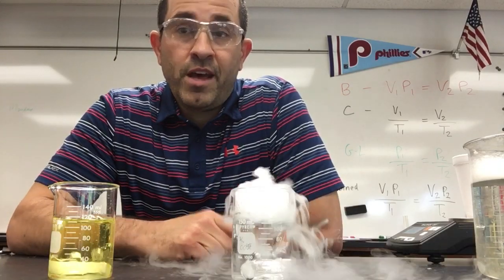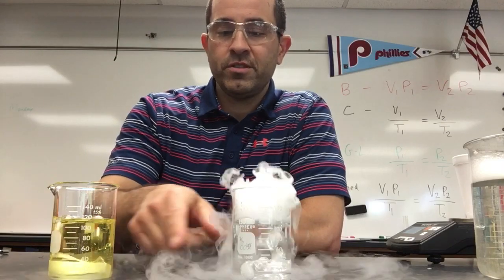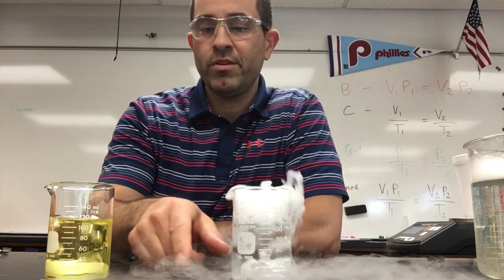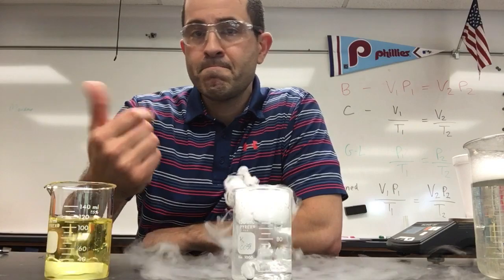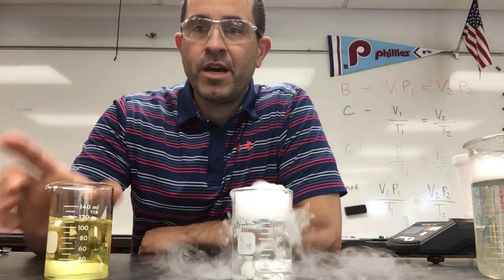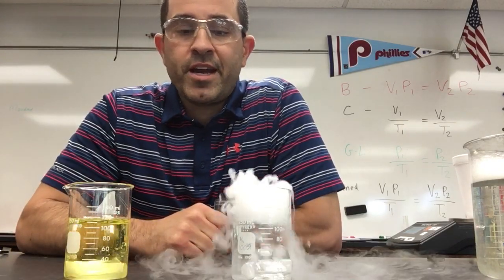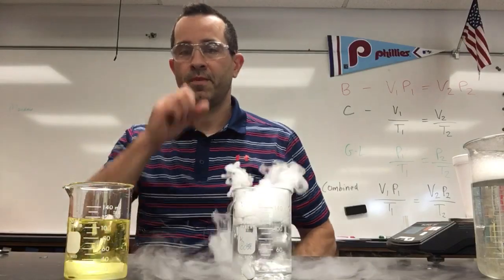What do you think the identity of the fog is? Most people think that it's carbon dioxide, right? Well, if it's carbon dioxide, look, there's frozen CO2 and we have solid CO2 in both of these. We see bubbles in both. But there's no gas coming out of this one, no fog coming out of this one. So this fog that we see isn't carbon dioxide gas. Well, what else could it be?